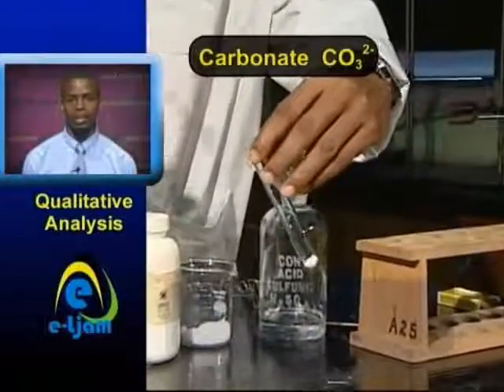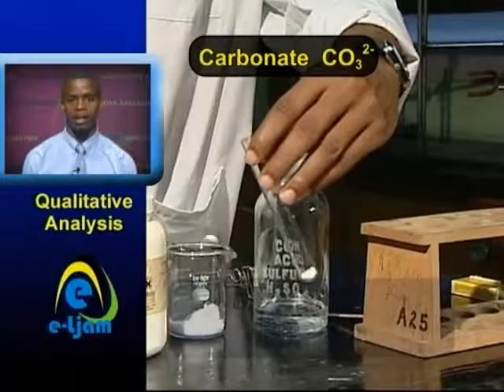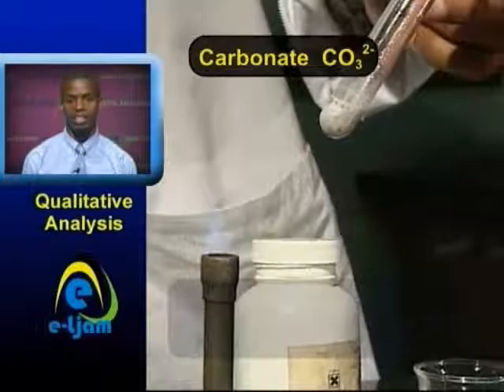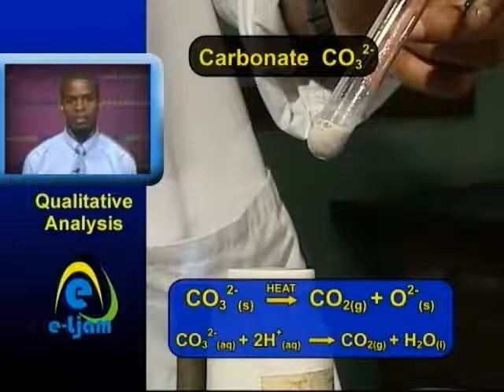Carbonate. When heated, the solid decomposes and carbon dioxide is evolved. On addition of dilute hydrochloric or nitric acid, carbon dioxide and water are formed.